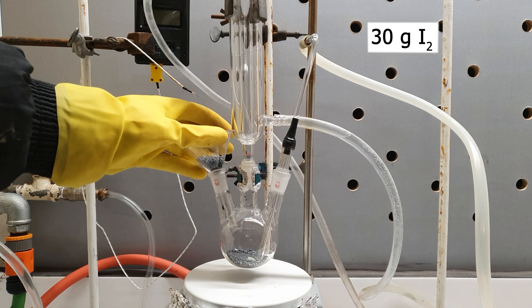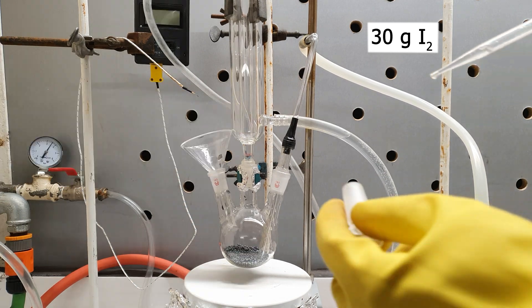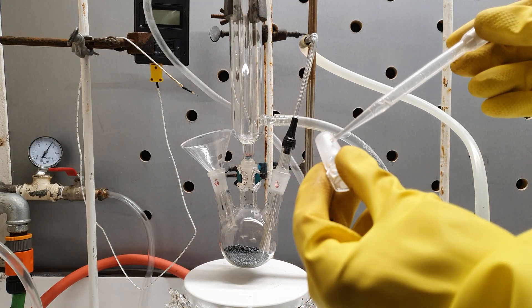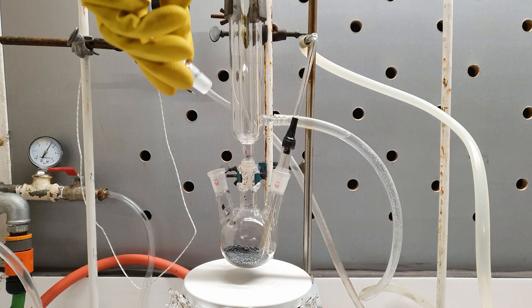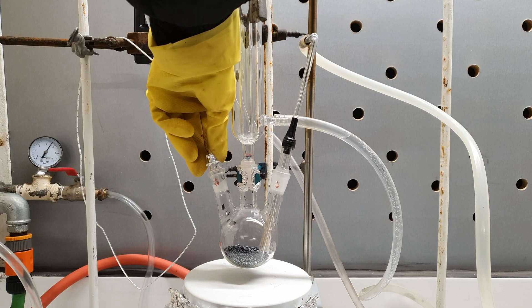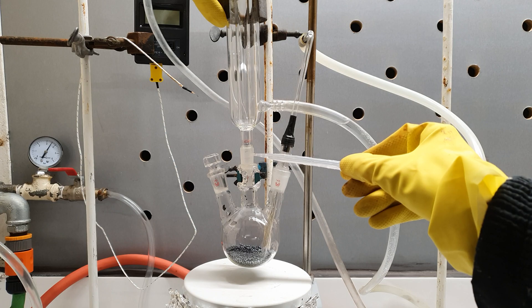I start off by charging the reaction flask with 30 grams of iodine. Then I lubricated the glass joints with some concentrated sulfuric acid. As I said earlier, iodine monochloride acts a lot like bromine, so it will manage to escape even through the tiniest cracks.